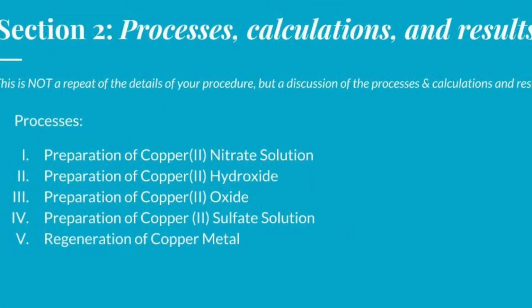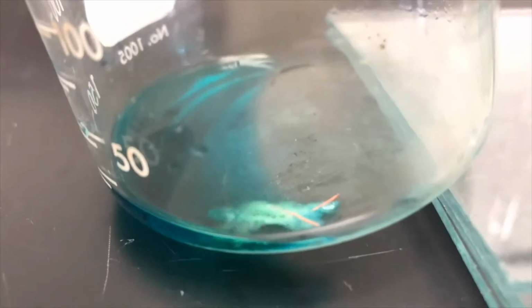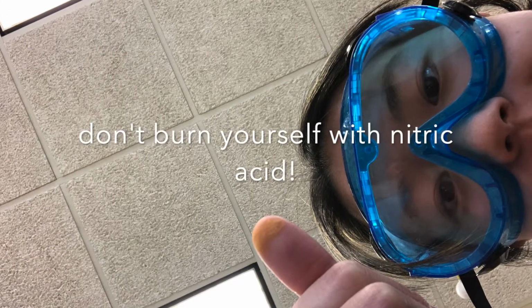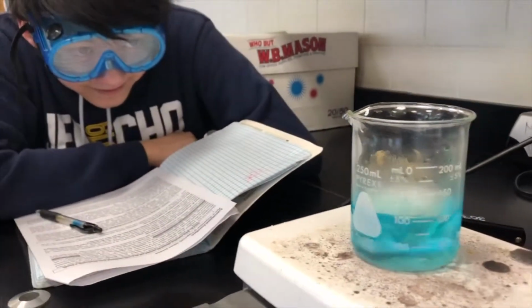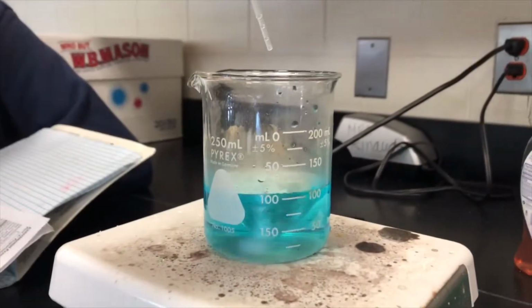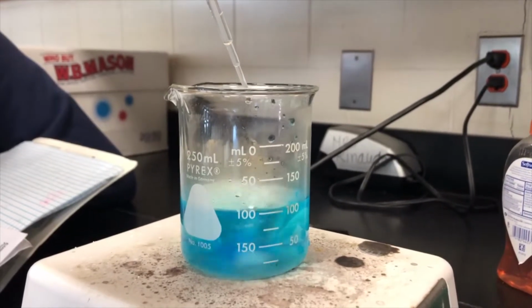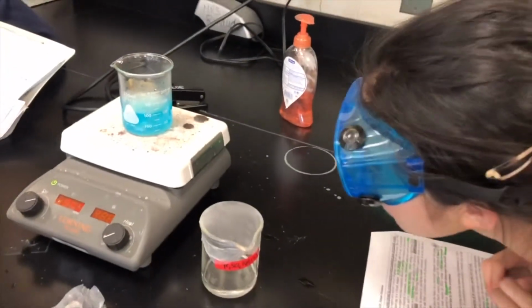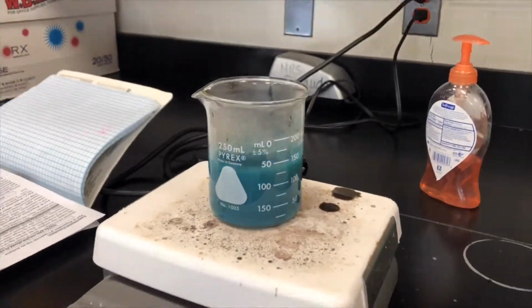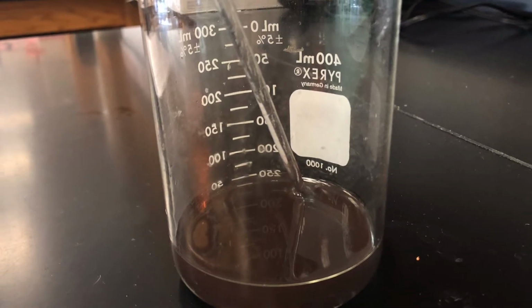The processes of this investigation included the preparation of copper 2 nitrate solution, preparation of copper hydroxide, preparation of copper oxide, the preparation of copper sulfate solution, and the regeneration of the copper metal.